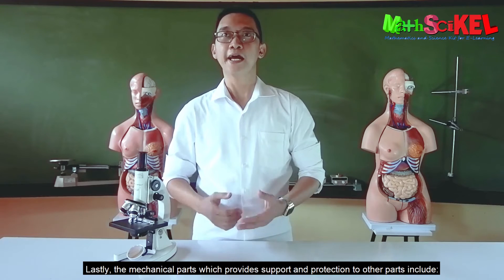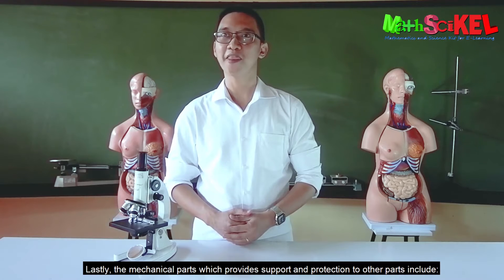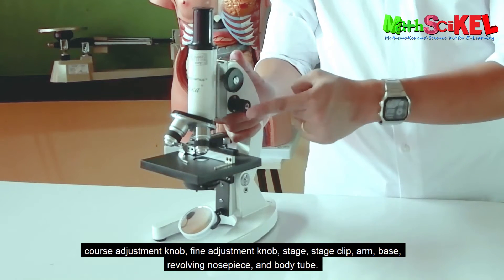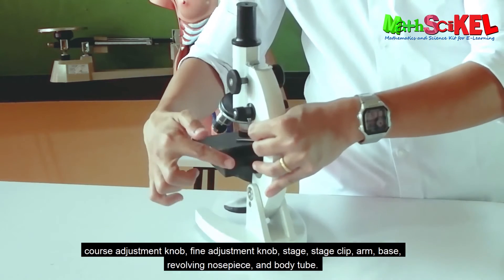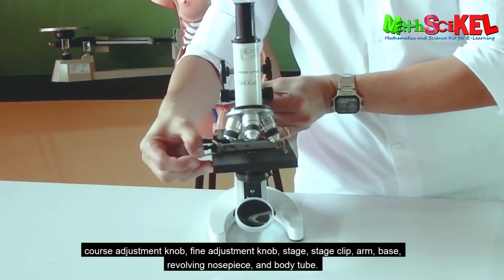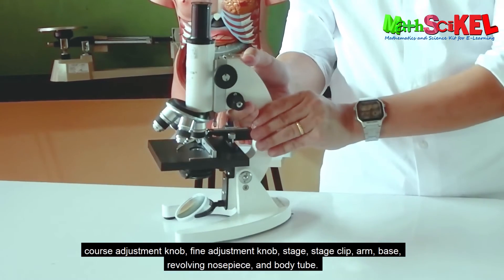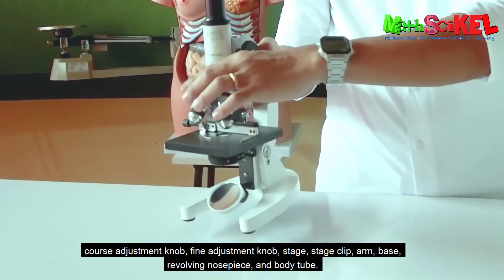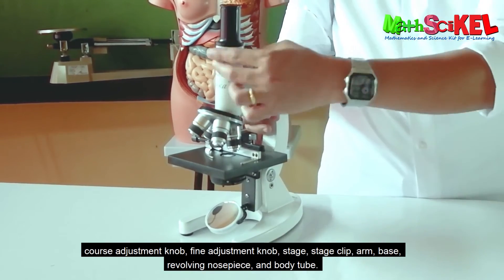Lastly, the mechanical parts, which provide support and protection to other parts, include the coarse adjustment knob, fine adjustment knob, stage, stage clip, arm, base, revolving nosepiece, and body tube.